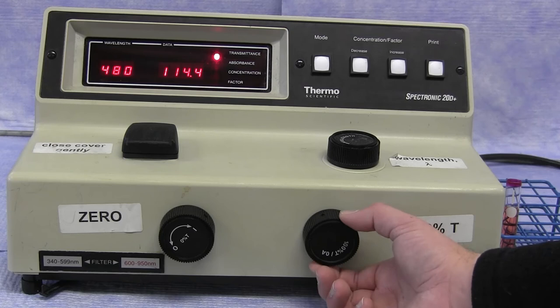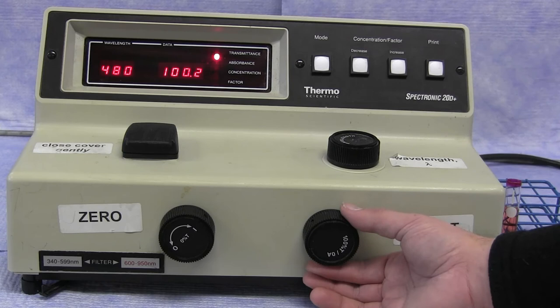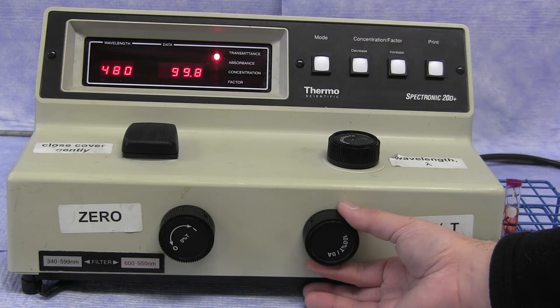This is a two-point calibration where it tells the instrument when the light is off and there is no sample, there should be 0% of the light getting through to the other side. Likewise, when you put in your solvent, you want it to read 100% because at this point, you're only interested in the absorbance of your sample, not the solvent. So any absorbance that's coming from water itself can be corrected for.